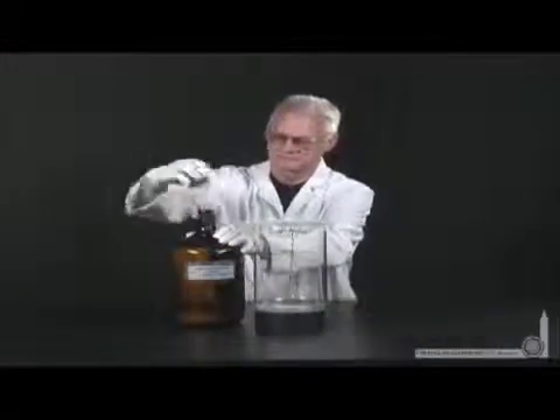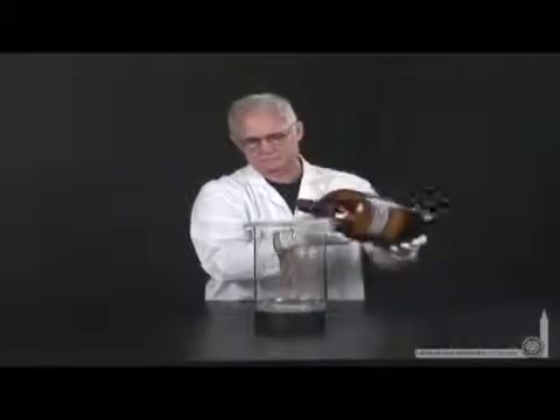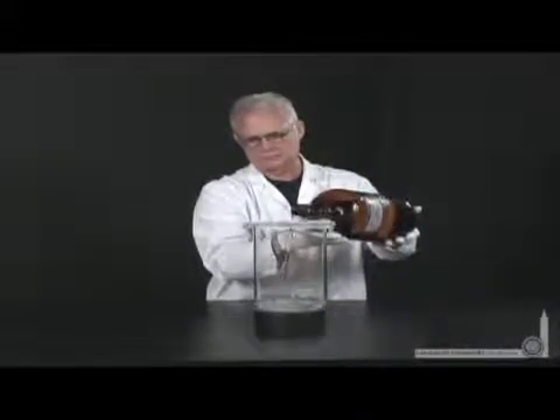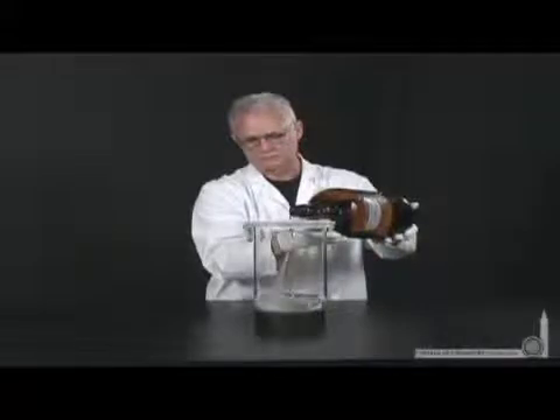For this experiment, Lani's taken solid copper metal in the form of copper wire and formed it into the shape of a tree. To this, he's adding silver nitrate solution.